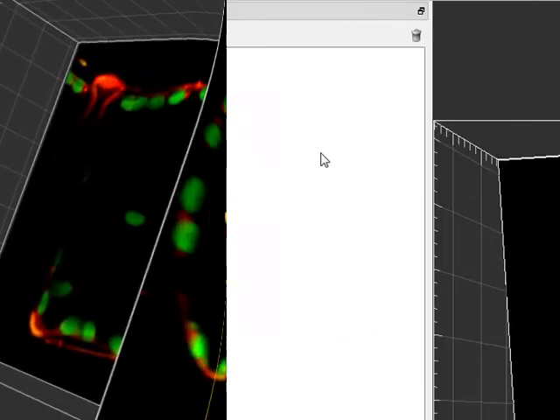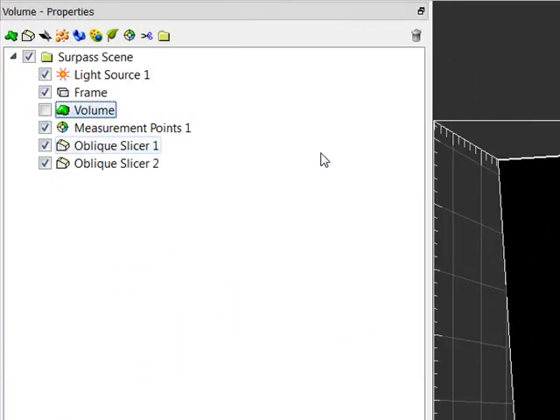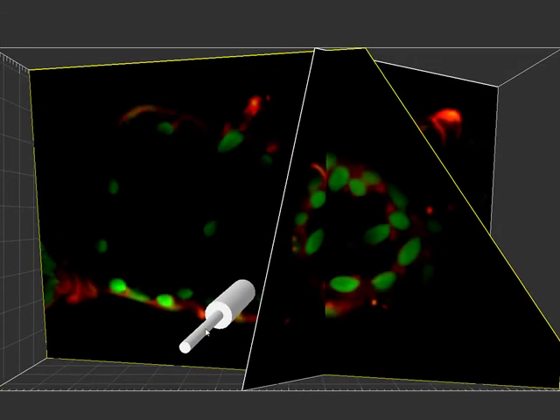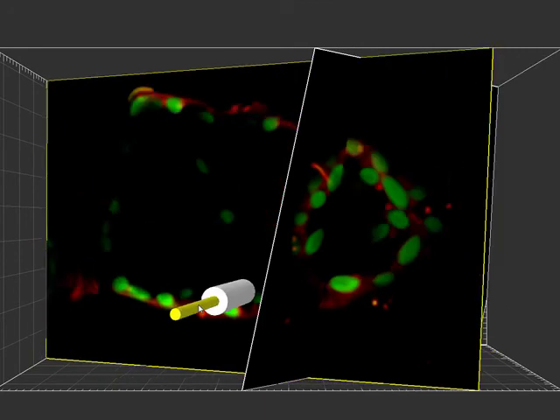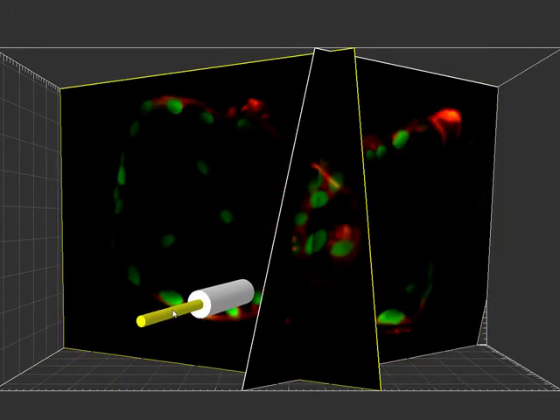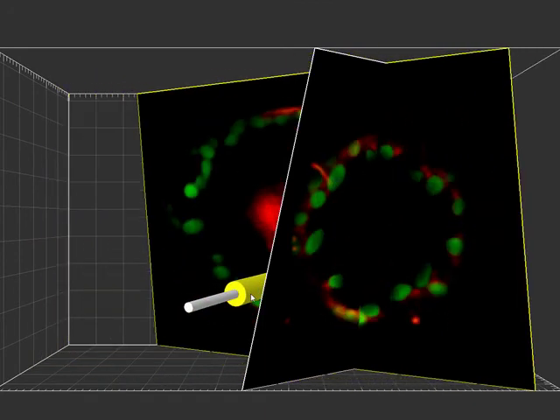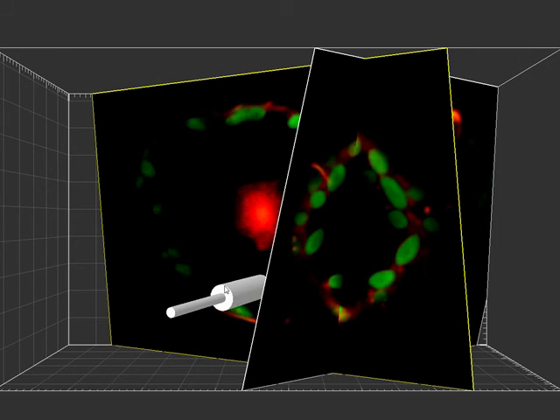Similarly, the oblique slicers can be used to re-slice the image and place measurement points at the desired location. The oblique slicer can be moved and rotated to any angle, allowing complete control over which portion of the image is visible.